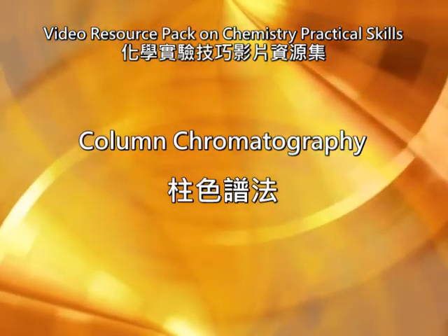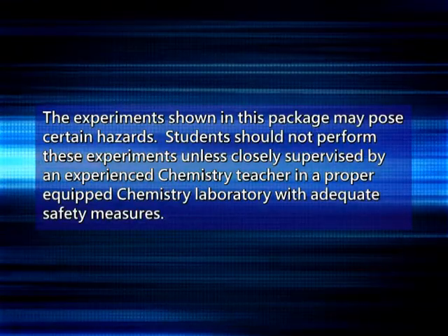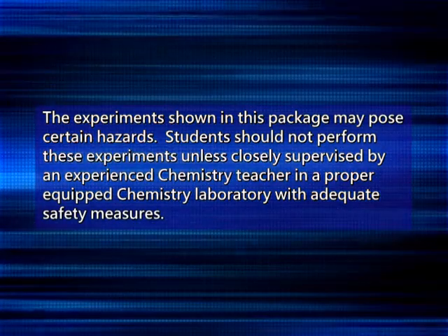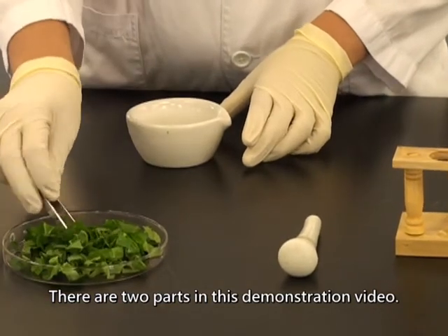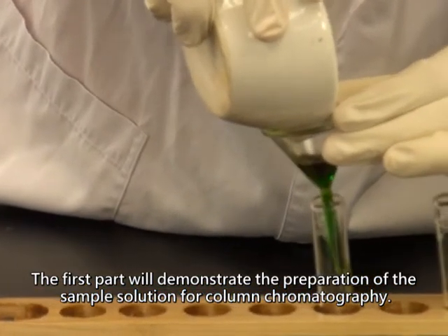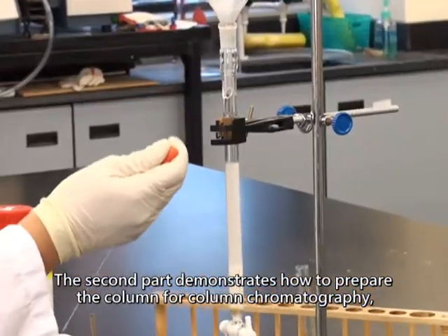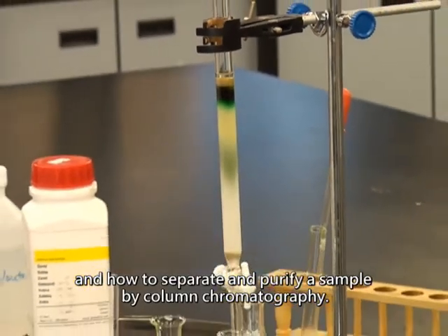Column Chromatography. There are two parts in this demonstration video. The first part will demonstrate the preparation of the sample solution for column chromatography. The second part demonstrates how to prepare the column for column chromatography, and how to separate and purify a sample by column chromatography.